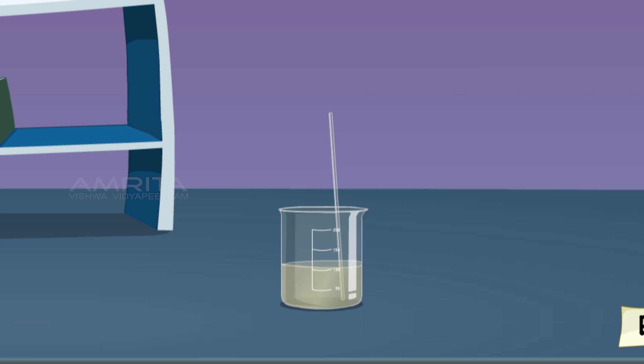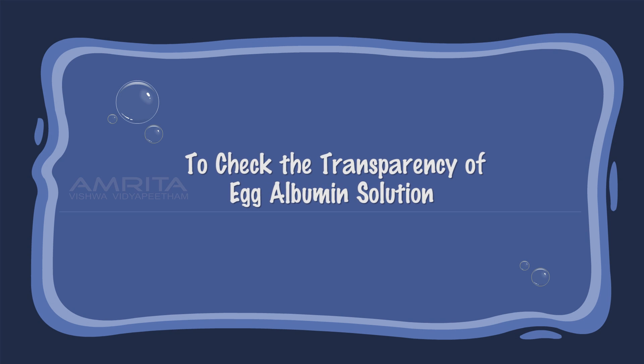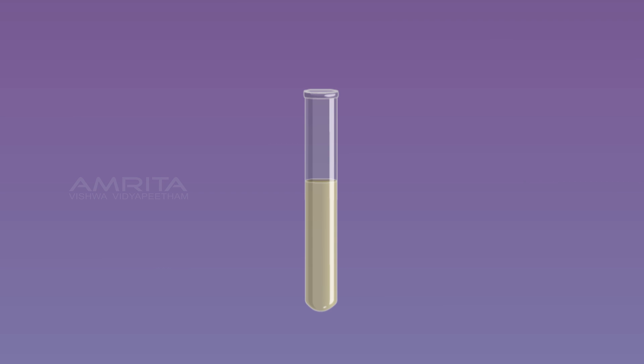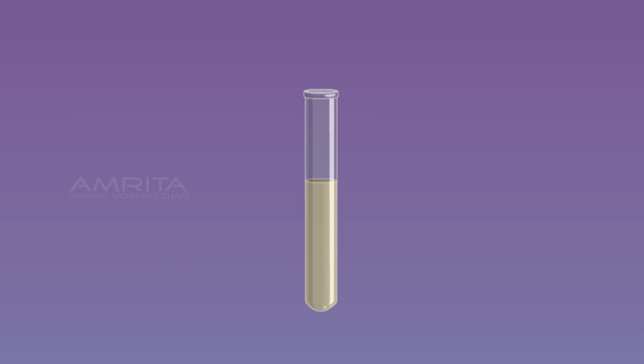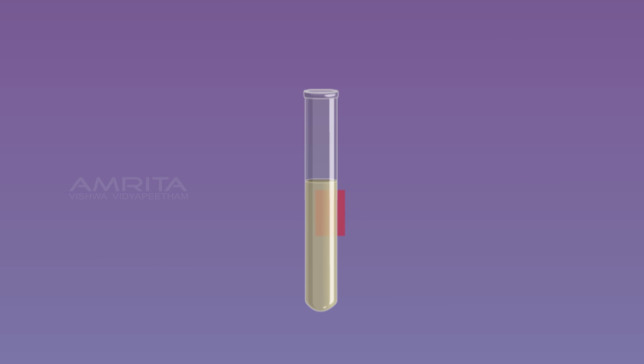To check the transparency of the egg albumin colloid, take some colloidal egg albumin in a test tube. Paste a small strip of cellophane paper on one side of the test tube and view it from the other side. The cellophane paper can be seen vaguely from the other side, indicating that a colloid is translucent.